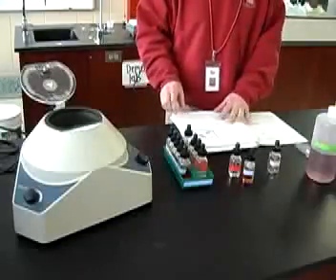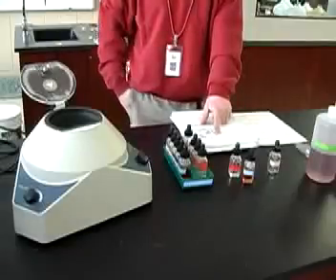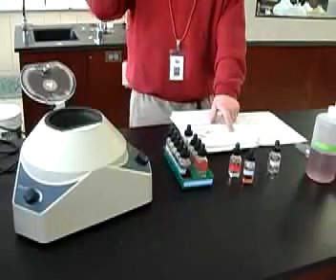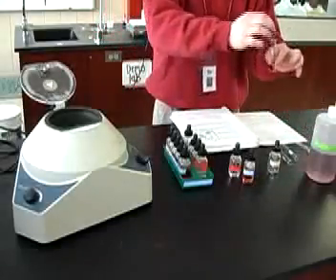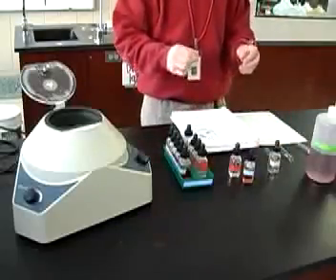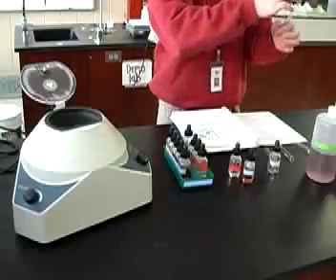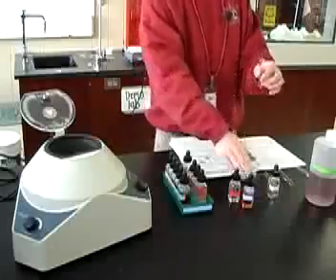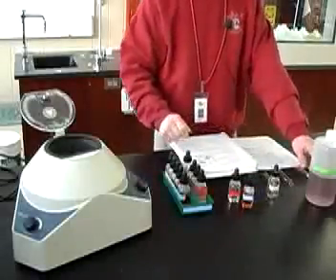Checking the pH. To check the pH of the solution, put a piece of, it says litmus paper, we have pH paper, onto a clean glass plate or a watch glass. Dip your stirring rod into your test tube, then take your stir rod out and touch it to the litmus paper, or in our case the pH paper. Don't dip the test paper into the test tube. You'll contaminate your solution. So make sure to put the test paper down here, dip your stir rod in, and then touch the test paper.